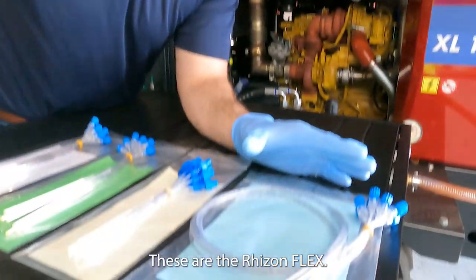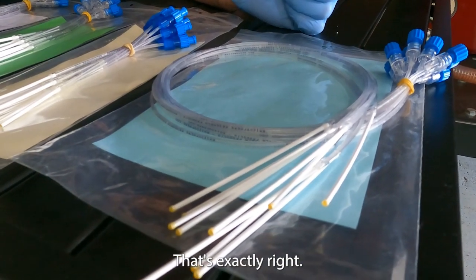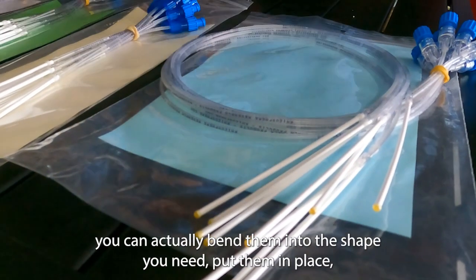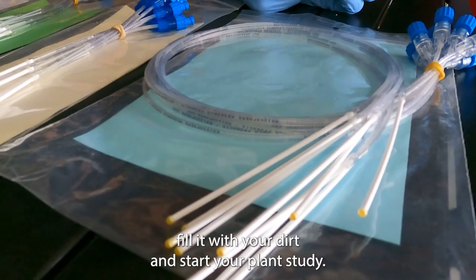These are the Rhizon Flex — they are called flex because they are flexible. What you can do is actually take these and bend them into the shape you need when placing them in your pot or study chamber, then fill it with your soil and start your plant study.